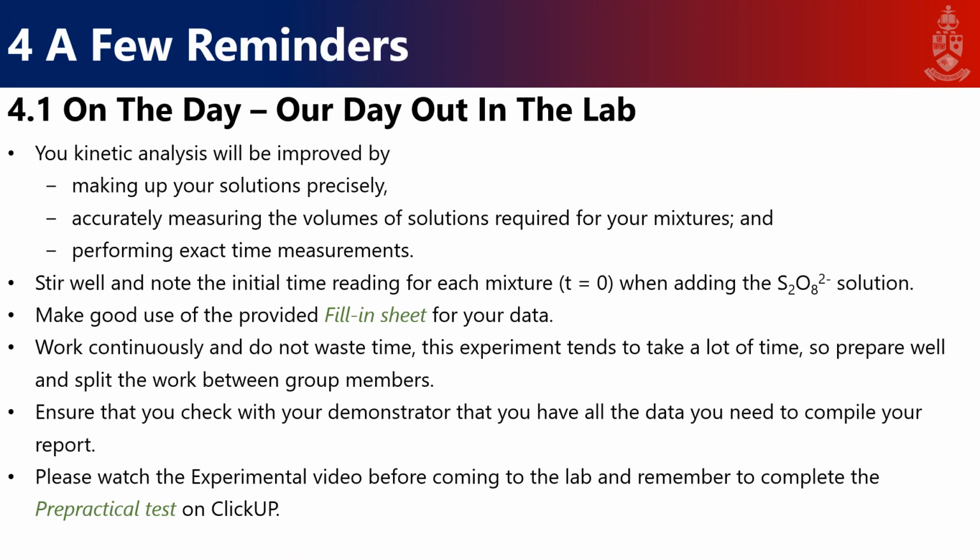Just a few last things. Your kinetic analysis will definitely improve by making up your solutions precisely, by accurately measuring the volumes of your mixtures, and then by performing exact time measurements. It's really much simpler and easier to work with the data if you work carefully in the lab. Please note that you need to stir well and note the initial time reading for each mixture. So you need to make a reading for time 0 when you add your persulfate solution.